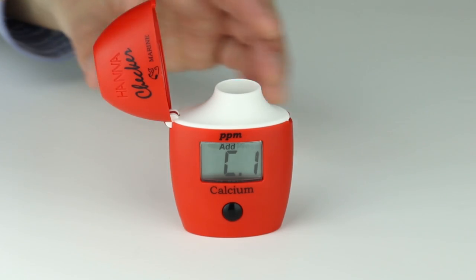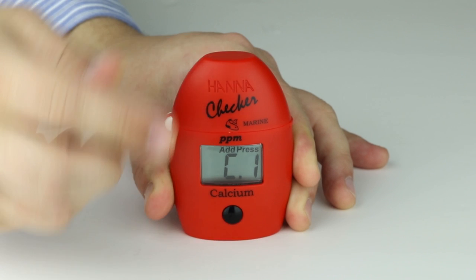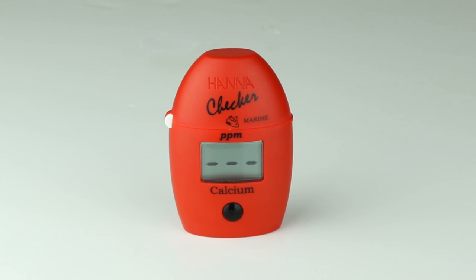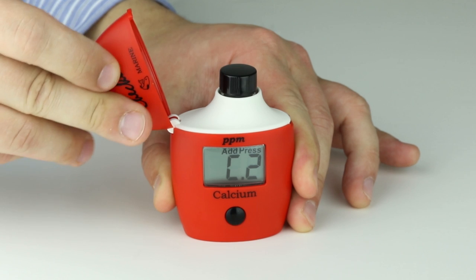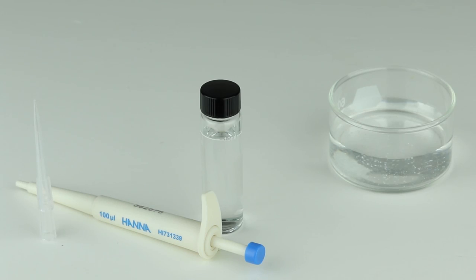Place the cuvette into the meter, close the lid, and press the button. Once 'Add C2' appears, you are now ready to proceed. Next, we'll add our sample. We'll use the mechanical pipette to dose exactly 0.1 mil of sample to our cuvette.